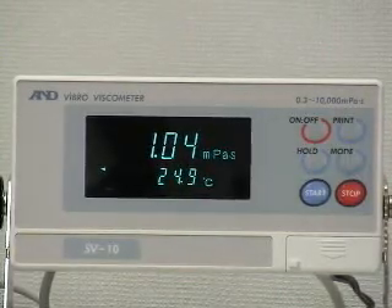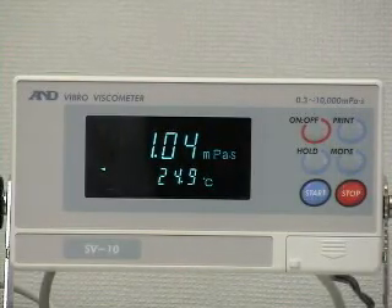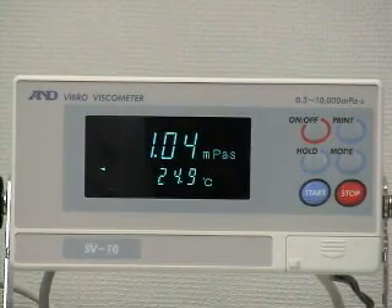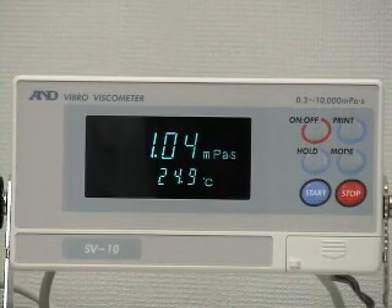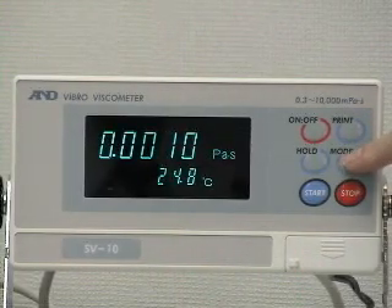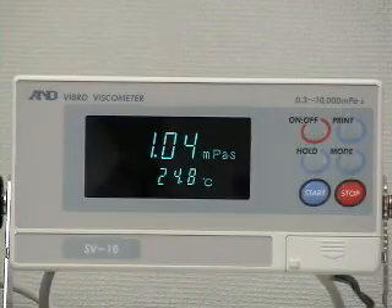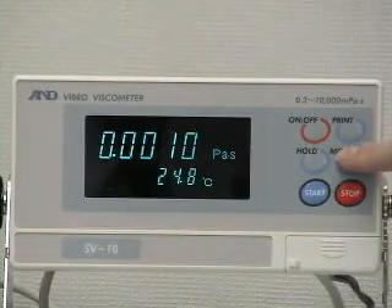During the measurement, press the hold key to freeze the display temporarily. The hold indicator will appear on the left side of the display. In hold function, the processing indicator blinks to show that measurement is still processing. Press the hold key again to release the hold function and the display shows viscosity and temperature on a real-time basis again. The unit of viscosity can be changed between millipascal seconds and pascal seconds; centipoise and poise can also be selected. Even in hold function, the unit displayed can be changed by pressing the mode key.